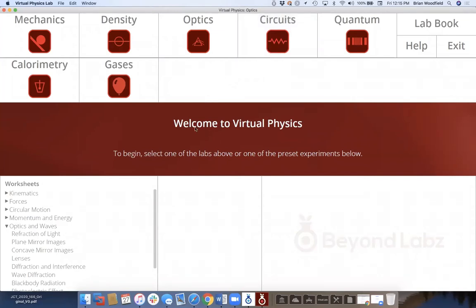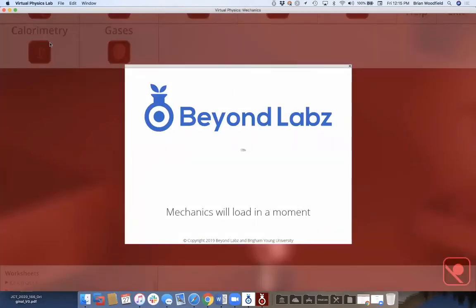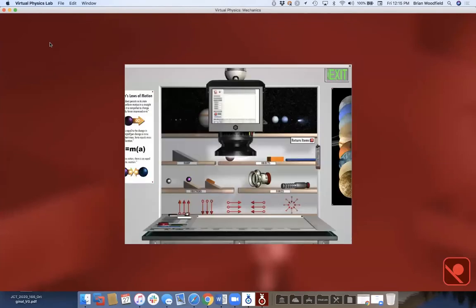In circuits you can build any circuit up to 35 components — inductors, capacitors, resistors, light bulbs, function generators, and oscilloscopes. These benches also appear in the general chemistry lab: quantum mechanics, spectroscopy, calorimetry, and gases. But for physics I really want to focus on mechanics, where a good chunk of your class will use the labs.